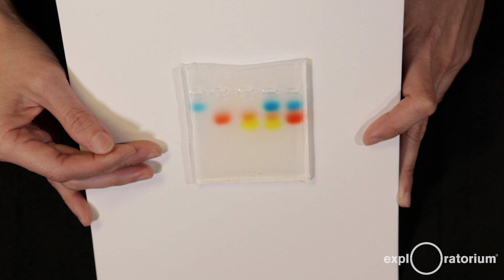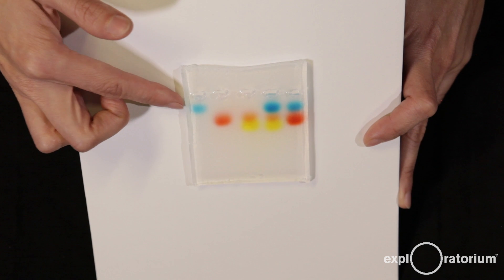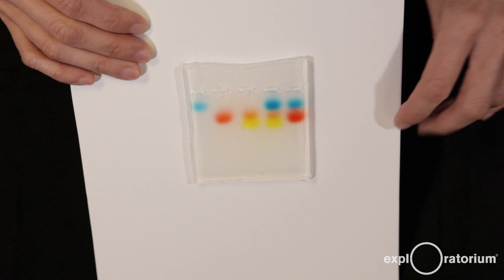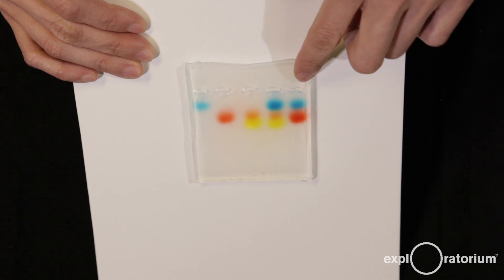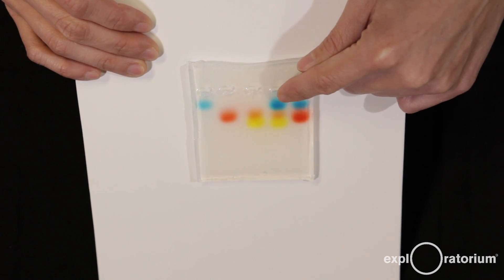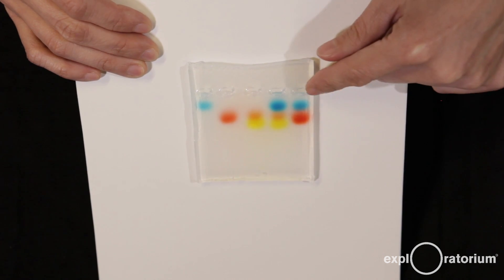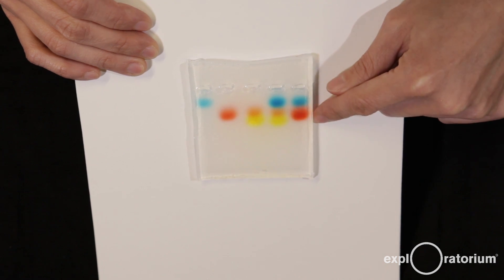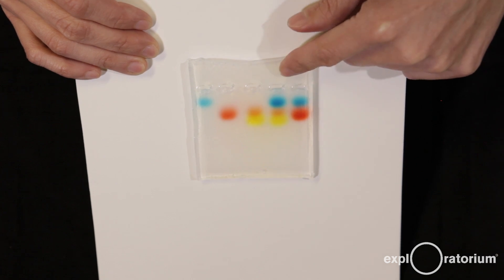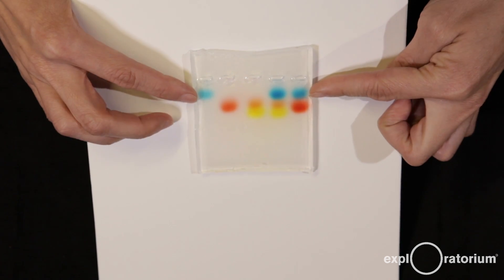The rate that the dyes move depends on their size — the smaller the molecules, the quicker they move through the gel. The larger ones, like the blue, lumber through and take longer. The fourth and fifth lanes have multiple colors: lane four was green dye, which separated into blue and yellow — there's actually no green dye molecule in this brand of green food coloring. In the purple lane you can see it separated into blue and red. Notably, the blue dye molecules in green and purple migrated at exactly the same rate as the blue in the blue food coloring — confirming they are the same molecule.